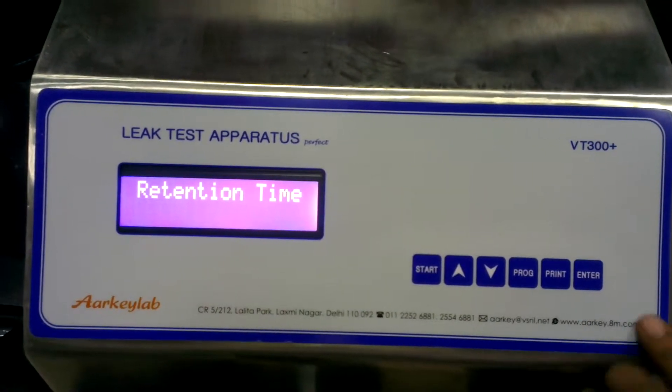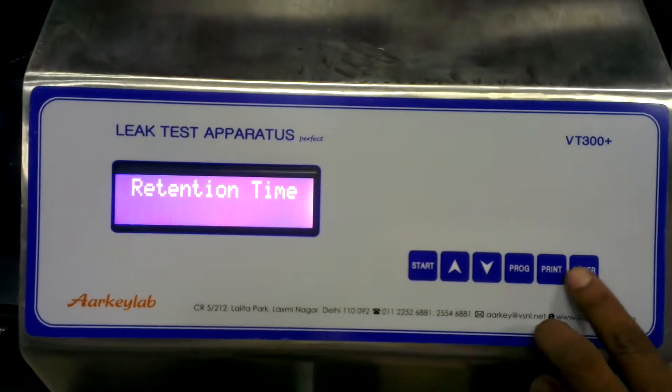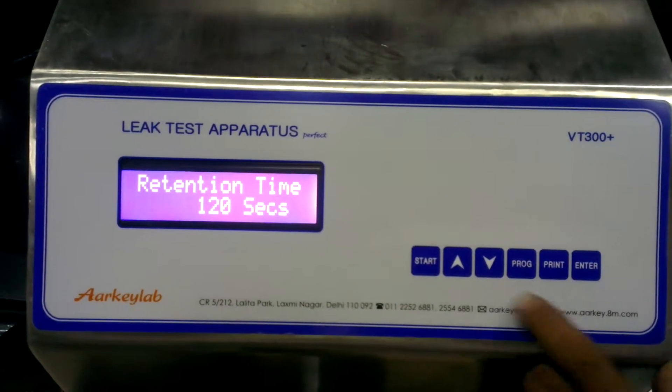Set the initial delay retention time to 120 seconds, then press Enter.